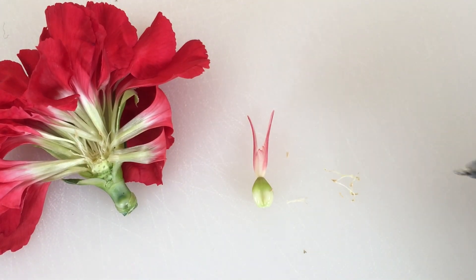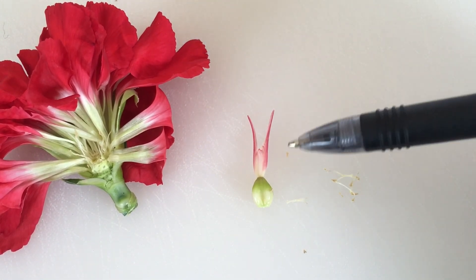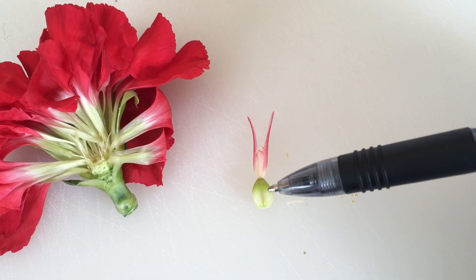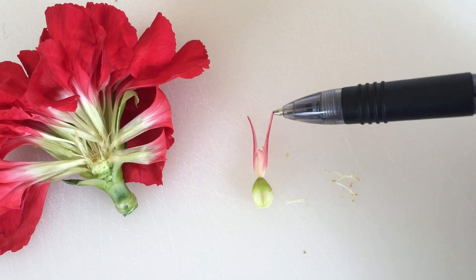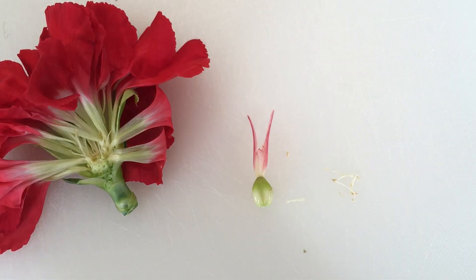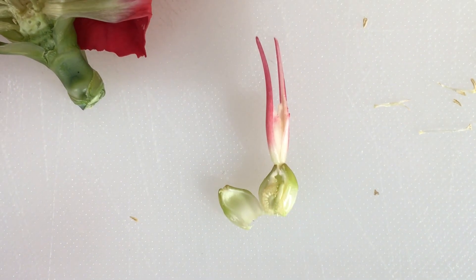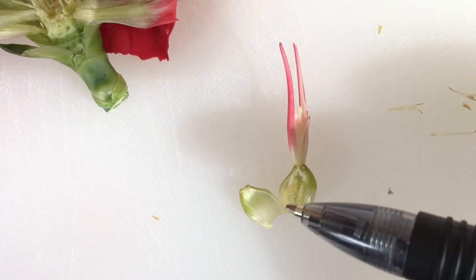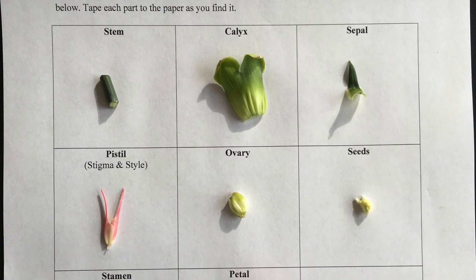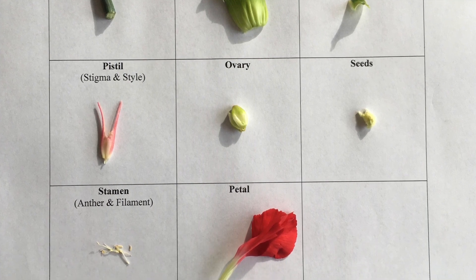Here I have the stamen, which consists of the anthers and filaments. Here I have the female reproductive parts, which is the ovary, the stigma, and the style. And then this is the remaining flower left over. Very last, I've opened up the ovary so that the seeds can be seen inside. Have your students gather a sample of each anatomy part and place it in the correct box on their flower dissection worksheet.